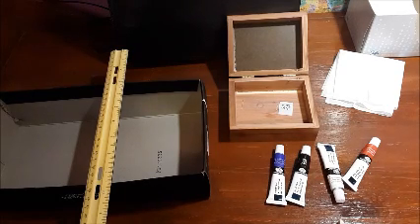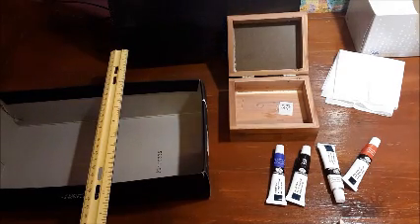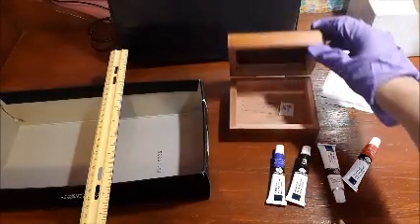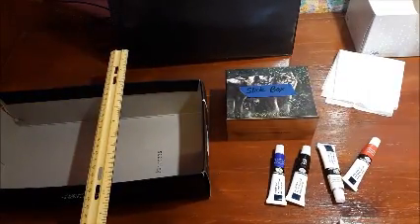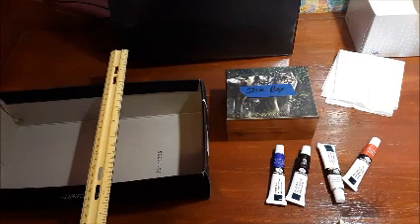You would make sure you view them under the objective lens that has 1000x magnification so that you can actually see the specimens. Once you were done viewing the slides under the microscope, you would place the slides back in the slide box to keep them safe, which I already have. Just gonna close that. And then, of course, you would pour any liquids that you had in the stain tray from your experiment into the stain collection vessels for them to be disposed of.